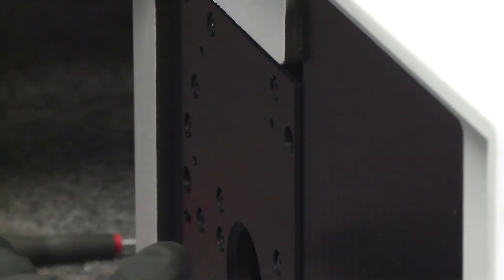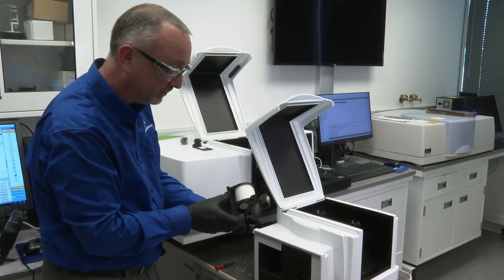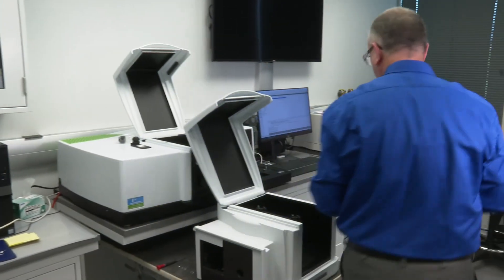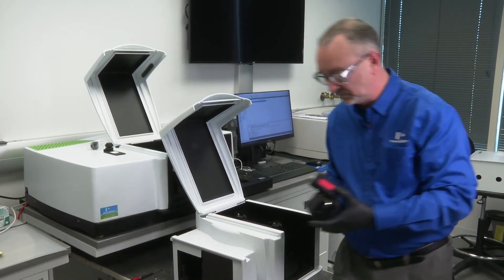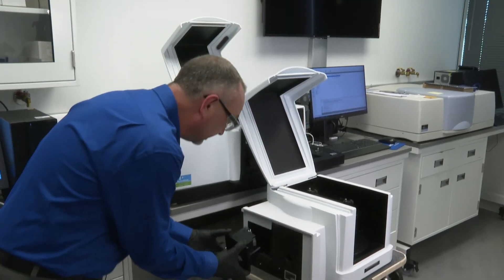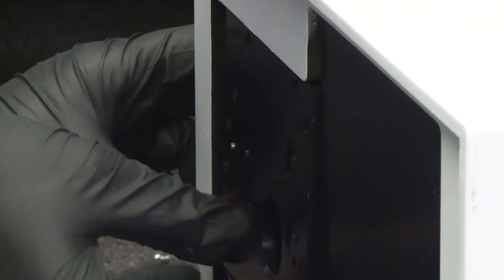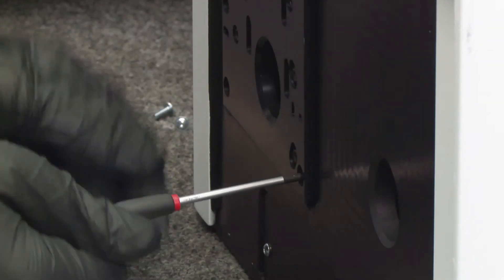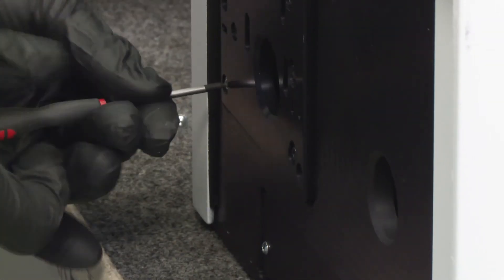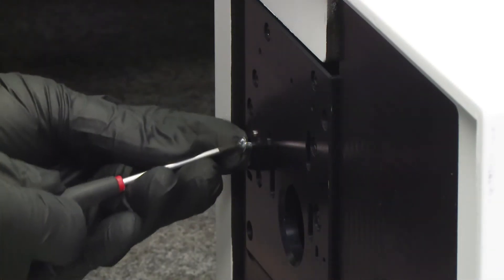Then we can carefully insert our finger to pull out the existing reference detector. Once again, this is the integrating sphere reference detector, silicon InGaAs. This detector can only go in one way — there's the connector. In this case, this detector only requires four screws and not five.